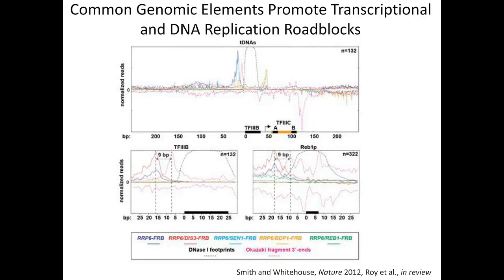So the reads with multiple hits, in our case, are the poly-A tails that are mapping to the ribosomal RNAs largely, as well as other RNAs. And so this is really a specific issue for RNA sequencing. I don't think the techniques that we use here are going to apply to mapping DNA reads because they're specific to the poly-A tail, which is not a part of the DNA sequence.